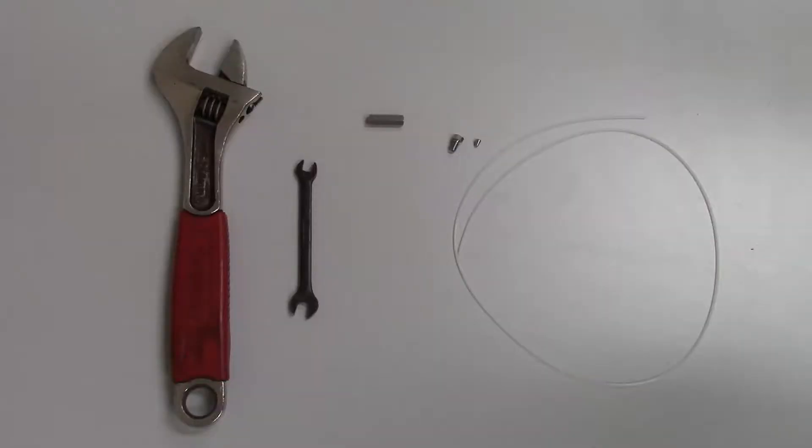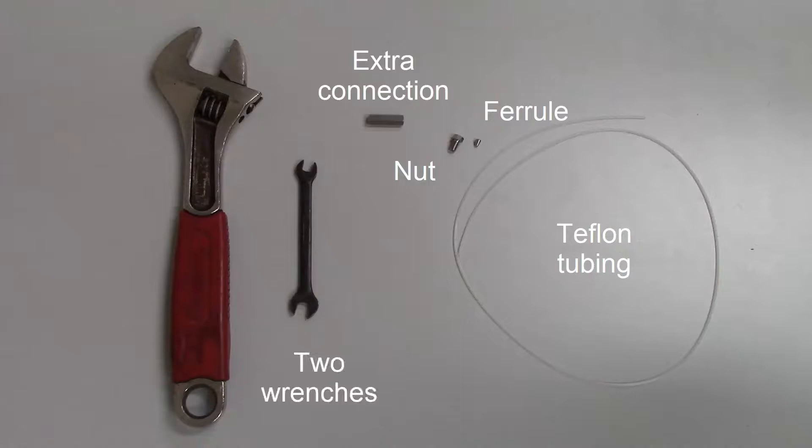The tools required for this procedure include a stainless steel nut, a stainless steel ferrule, a piece of 1/16th inch Teflon tubing, an extra connection piece to seat the fitting (in this case it's a union, but you can use other pieces including a column), and two wrenches.